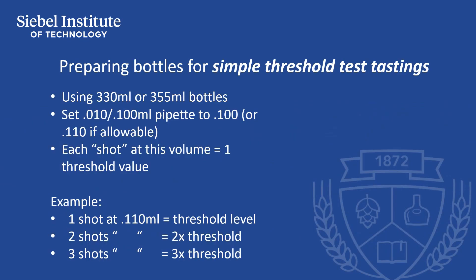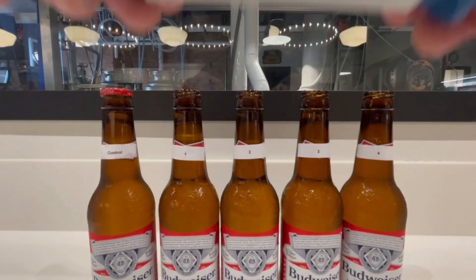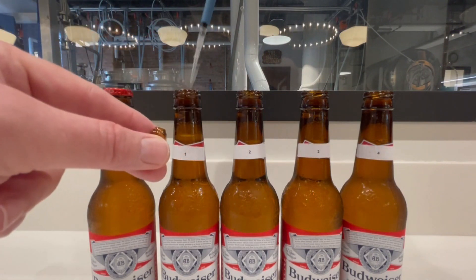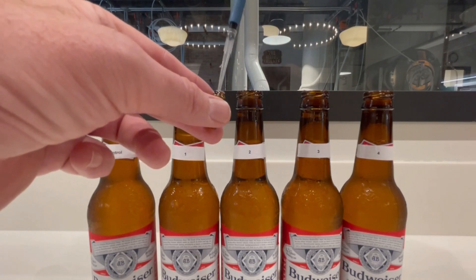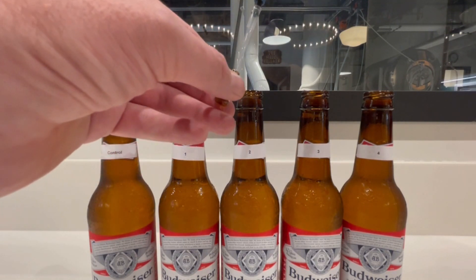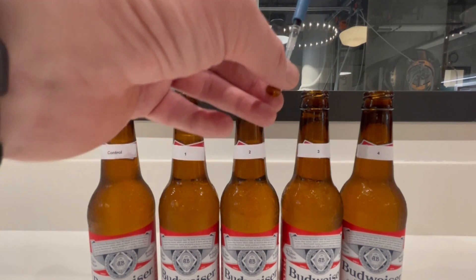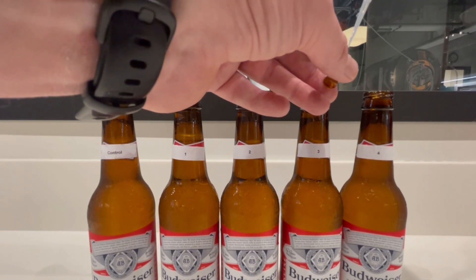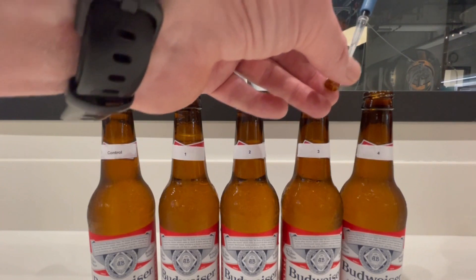An advanced way of using the liquid format kits is to spike differing amounts of solution to achieve different threshold rates. There are many different ways to spike beer at different levels, and this demonstration shows how to use just one vial of sensory solution to prepare four bottles of beer at ascending threshold rates. First, set the pipette to 100 uL. With each single shot of sensory solution into a bottle of beer, you will increase the concentration of the compound by one threshold level. With bottles labeled from one to four, add one shot of sensory solution to bottle one to result in one times threshold. The next bottle gets two shots, the bottle after that gets three shots, and the last bottle gets four shots.